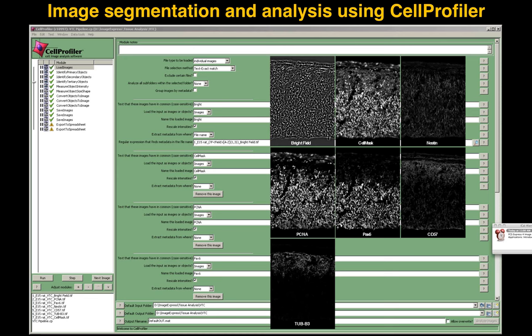It's very well packed with information, and you can always ask questions about how to best apply the segmentation to identify individual cells, as well as cell nuclei and cell bodies, and measure all the extraction features that you would like, such as intensity, shapes, area, whatever you need. It's a very versatile program to extract features from the images.